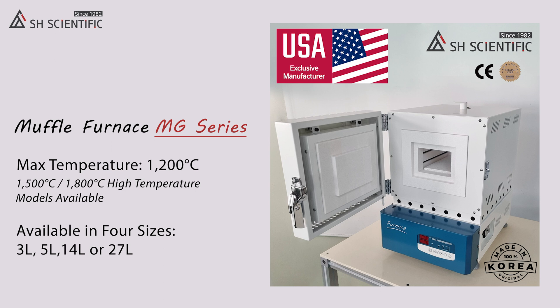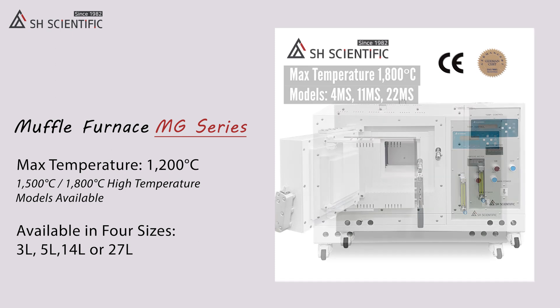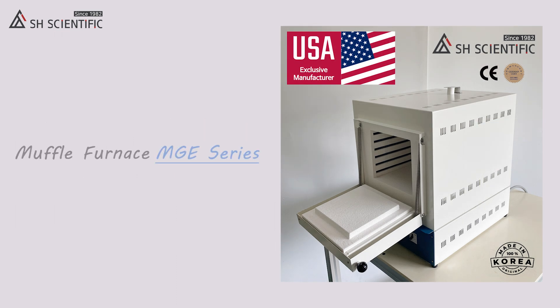Today I'm going to feature the 5 liter version. By the way, we do have 1500 and 1800 degree high temperature options. Outside of this MG line, there's also the most economical 1050 degree option.